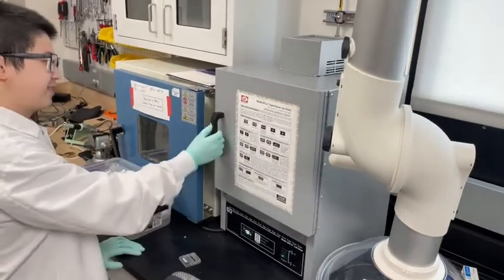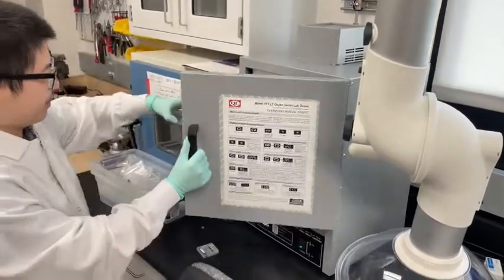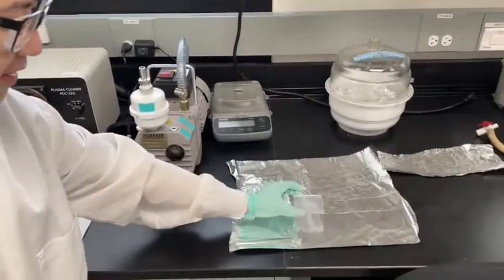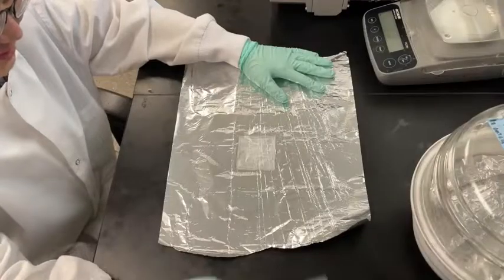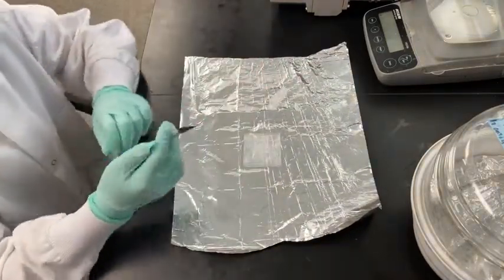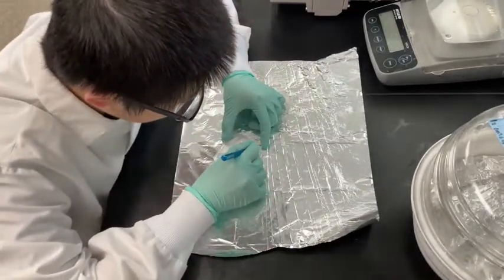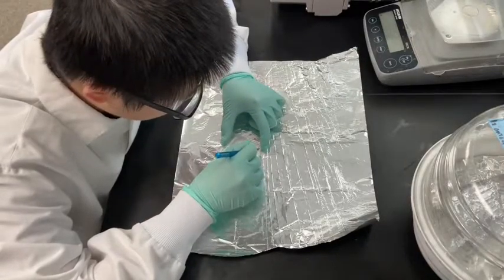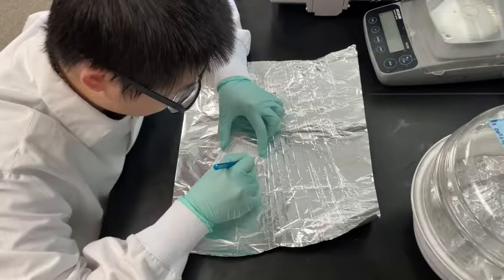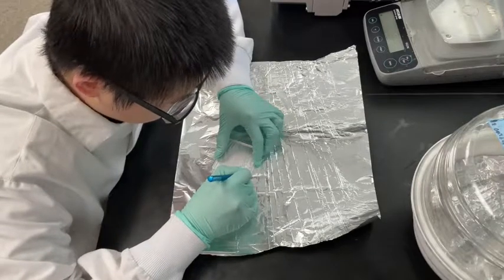Remove the part from the oven after the 24 hour curing time. You will next separate the PDMS chip from the mold. Use a scalpel to cut along the edges of the chip alongside the small vertical wall along the periphery of the mold. Cut along all four edges. Be sure not to cut fluidic features such as channels.